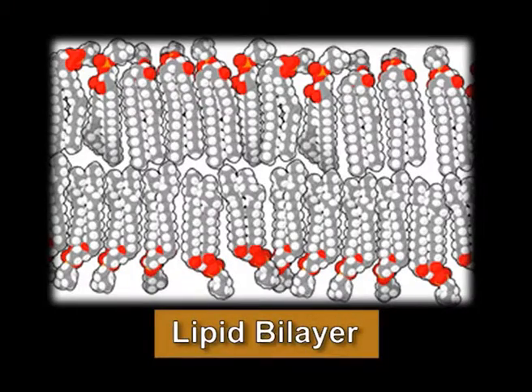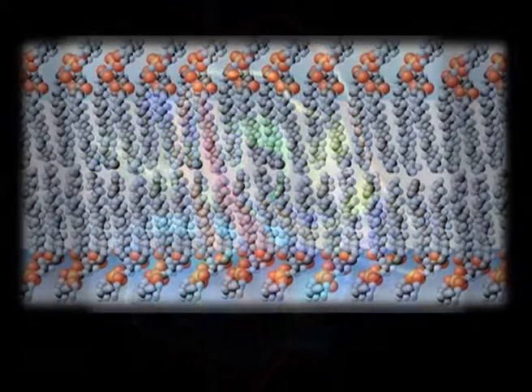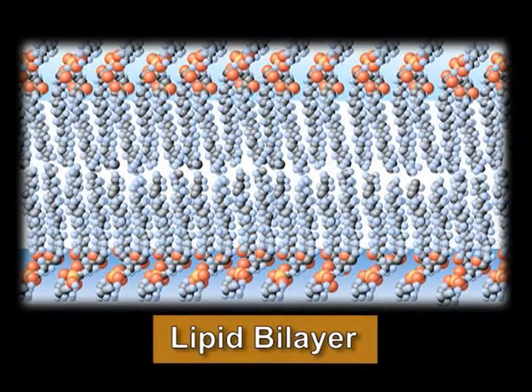The best example is the lipid bilayer. Now, as you know, the lipid bilayer has proteins in it. The arrangement of proteins on the outer leaflet of that bilayer is not the same as the inner leaflet. Because of that, it acts as a perfect example of an anisotropic membrane. As light goes through the outer leaflet, it will be refracted in a manner which is not the same as when light comes through the inner leaflet. And this anisotropy can be well studied using polarized light microscopy.